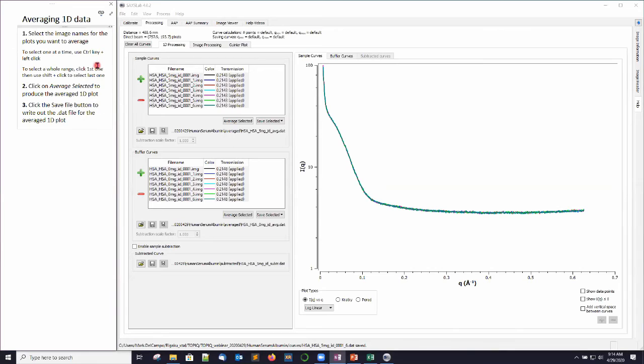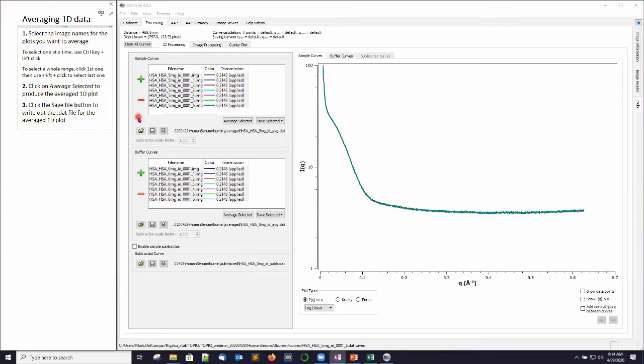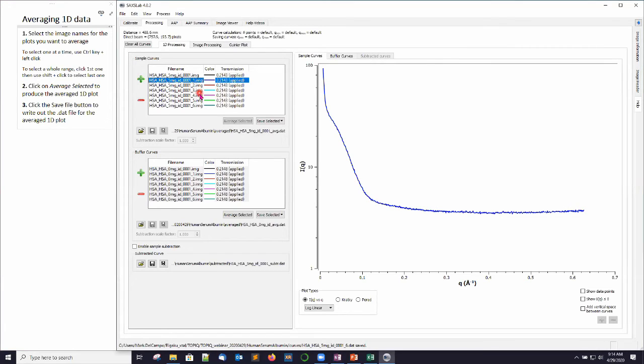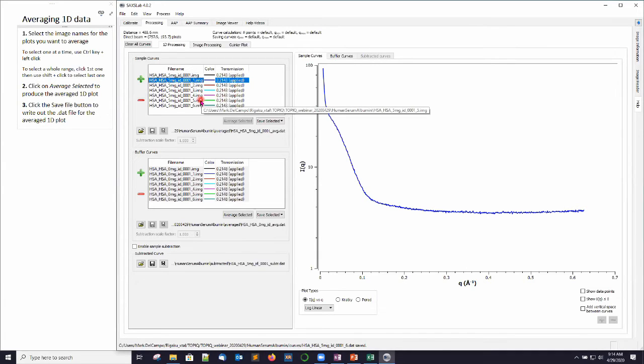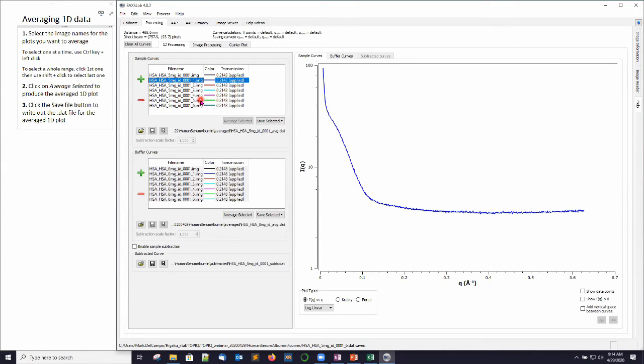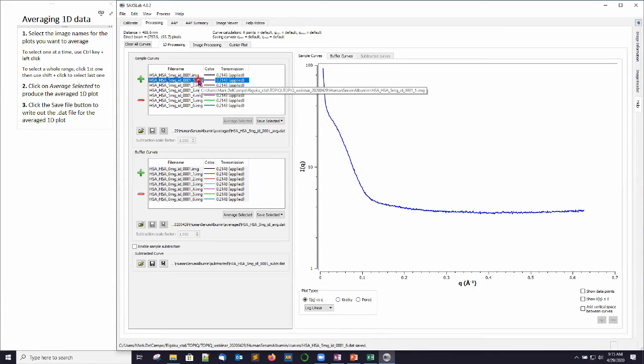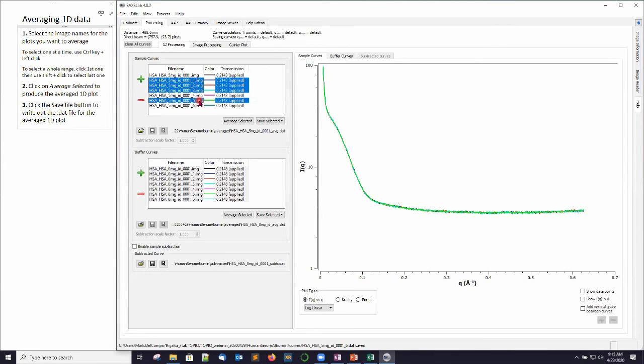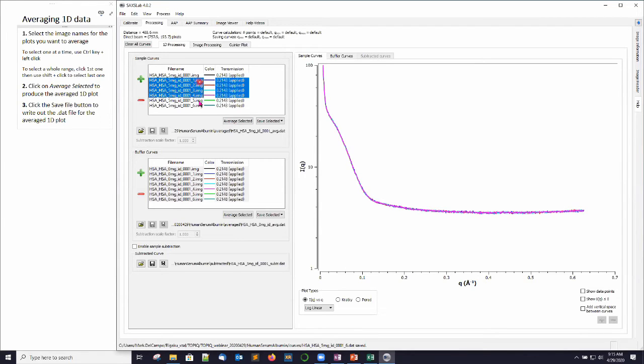So averaging the 1D data. In the event that you do see these changes, either an air bubble comes in at some point, or you have some aggregation happening, usually that happens at some stage during the total exposure, and you may want to average some images. So for example, let's just say for this 5 mg per ml protein sample, images 1, 2, 3, and 4 were fine, and then once we got image 5, we started seeing signs of aggregation. So one approach would be to do some averaging of the images before this bad thing happened during your exposure. So to do that in SAXSLab, what you want to do is select the images you'd like to average. So you can use the control key with your left mouse click to select images one at a time, or you can select the first one and use the shift key to select all subsequent ones.